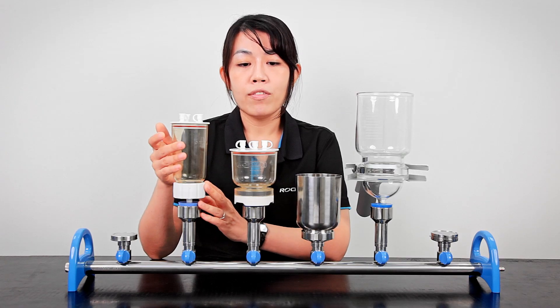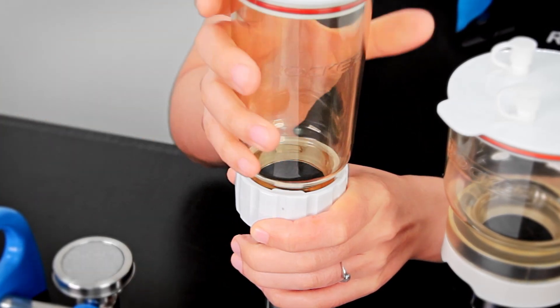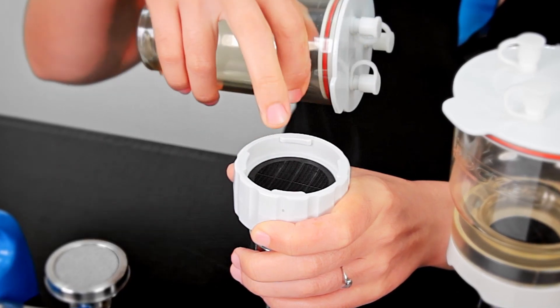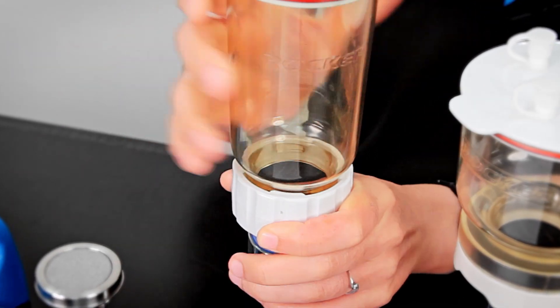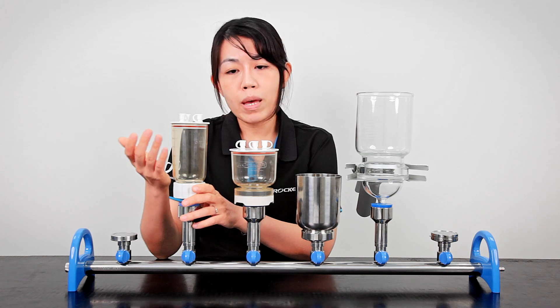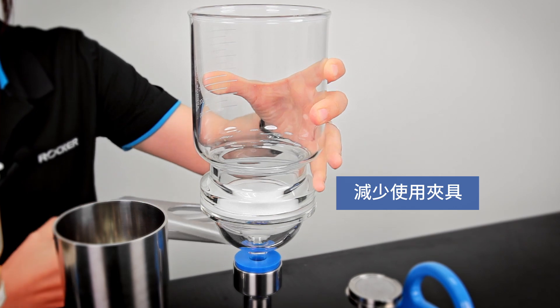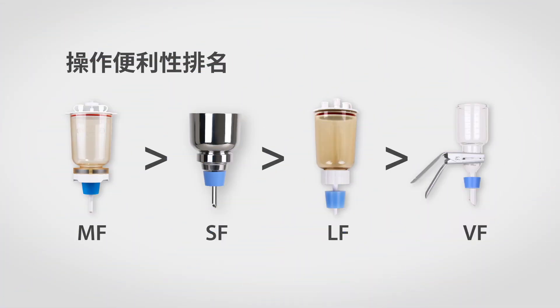As for the LF, it has our first spin lock design — very easy to lock with no need for a clamp, but it doesn't have the membrane guide. The filter membrane is placed inside a recessed area, so it takes a little more effort to take out. Compared to traditional holders, however, it is still much more convenient and durable. Overall, every Rucker collection is easier than the traditional clamp design, especially the MF and SF, which are both very scientist-friendly.